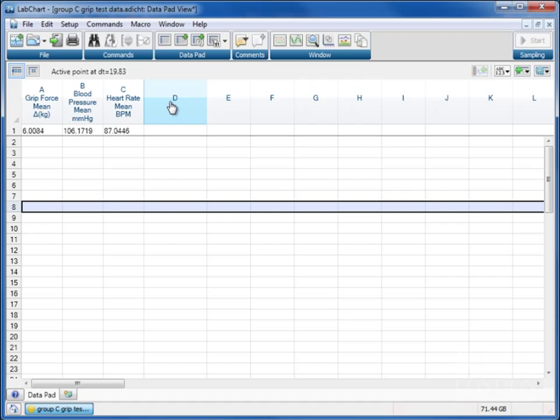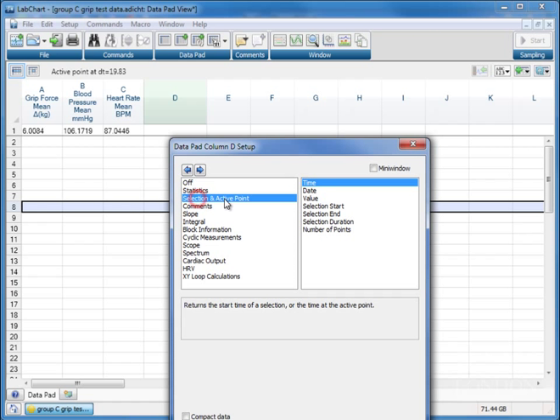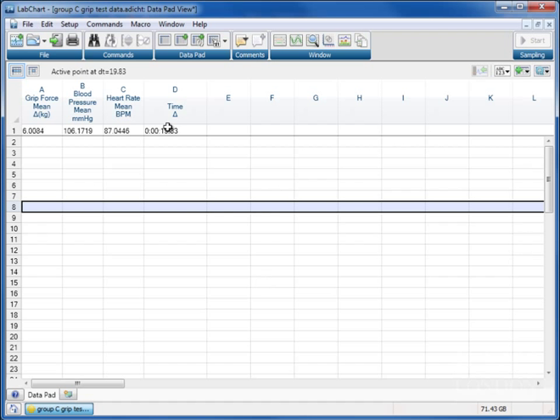Let's say we want to add the time at which the data was recorded, so we click on this and we go to selection and active point and we can choose time. And now it shows us the time of the data that we've selected. You'll see here the top row, row number one, has a little line between it and row number two. That's because row number one is showing the data at the point where we've selected this little black line here.